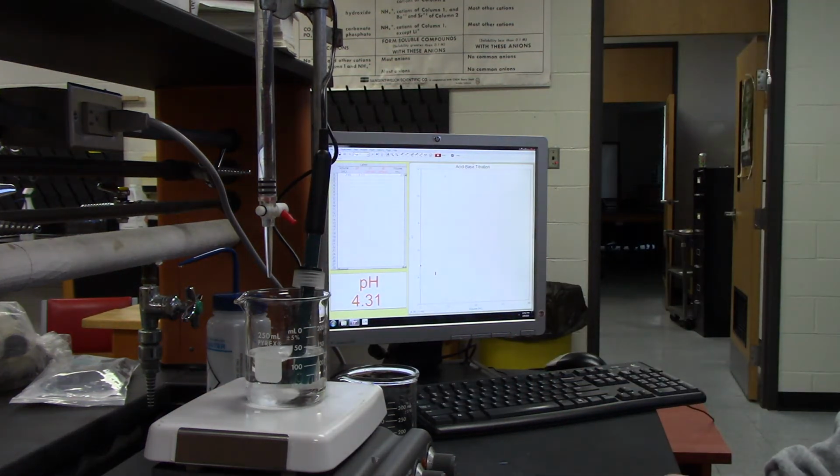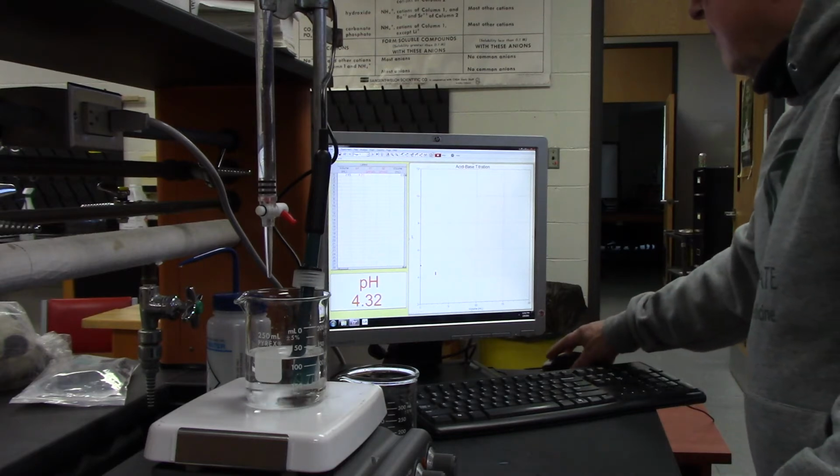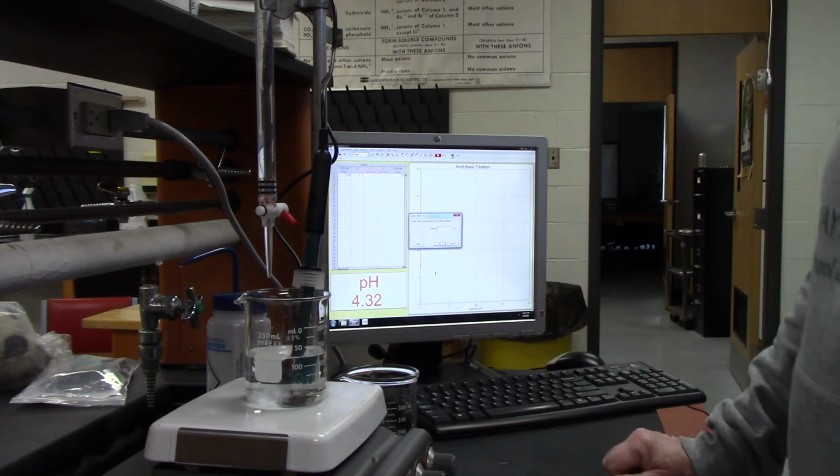All right. Right now I need to hit keep and write this volume down. 3.00.